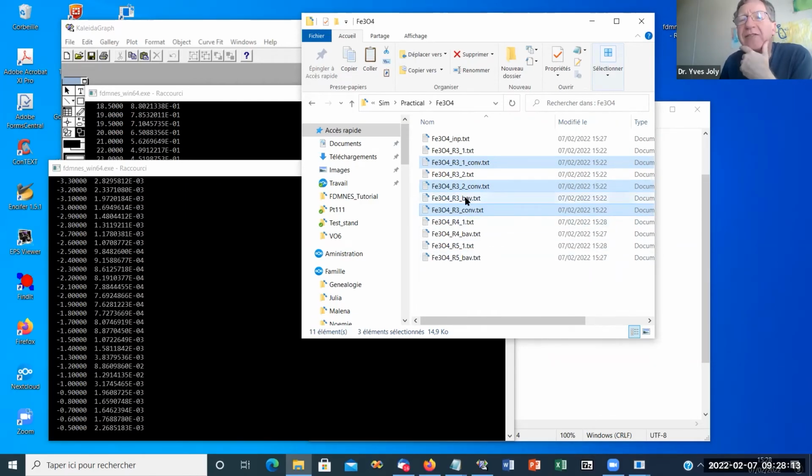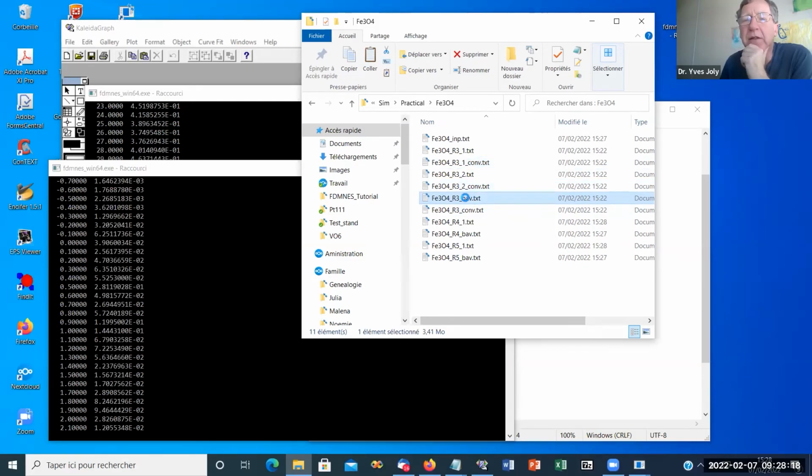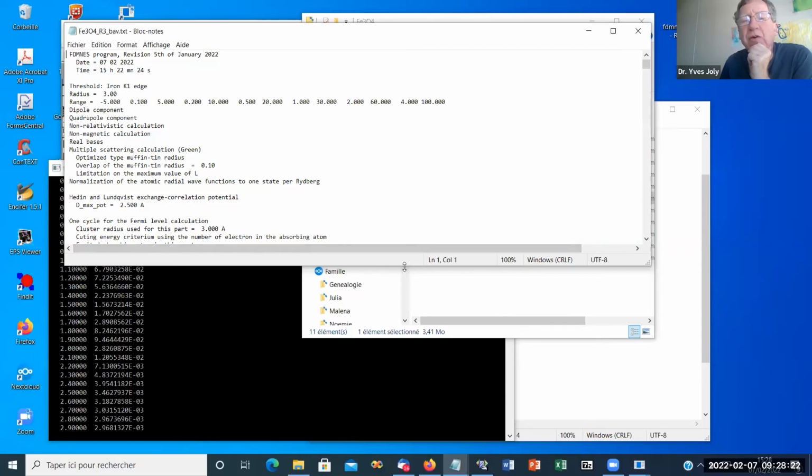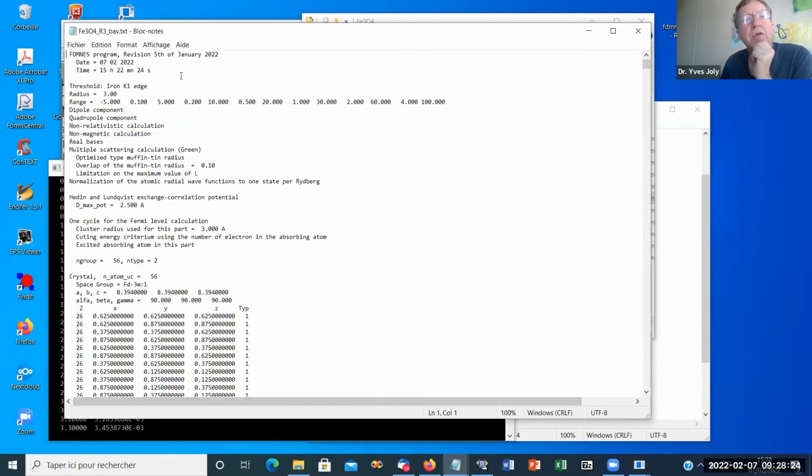We could have a look at the BAV file, this underscore BAV file. So in fact, you have many details. BAV is the first 3 letters of a French word, which is bavard. It means talkative in English. So in fact, you have many details on the calculation.